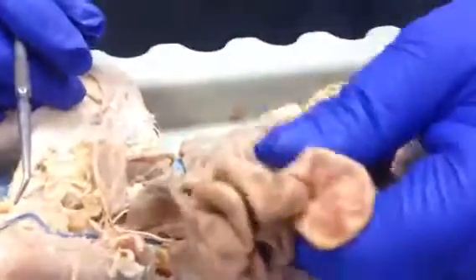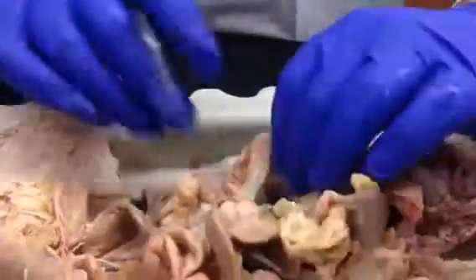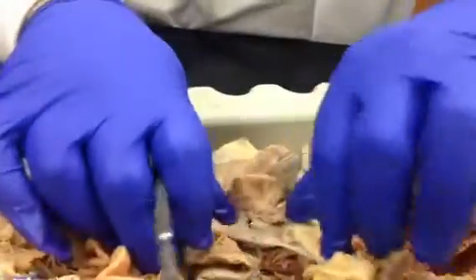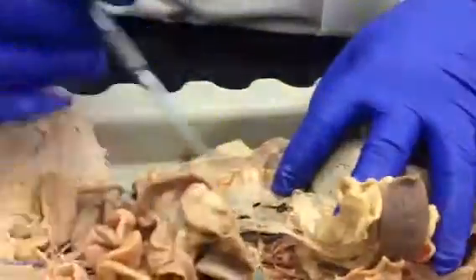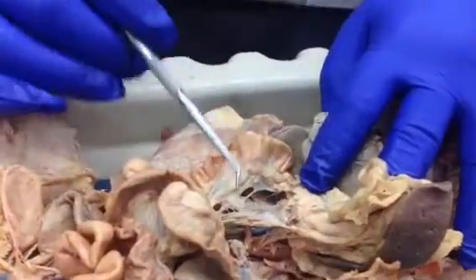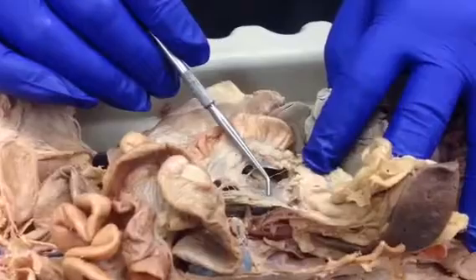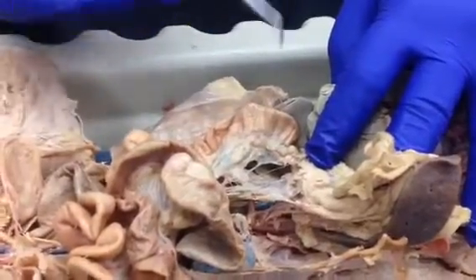The only other thing that's left is the hepatic portal, which this guy has a very sick one. I have to find my cat. My cat has a beautiful one, nice and big. This is going to be hard to see because this is not dyed. I'm trying to find the triply injected cat we have in there someplace that's injected with yellow. So if you see a yellow dye, you're looking at the hepatic portal system.